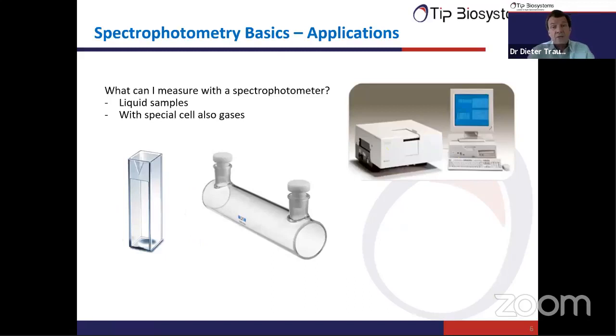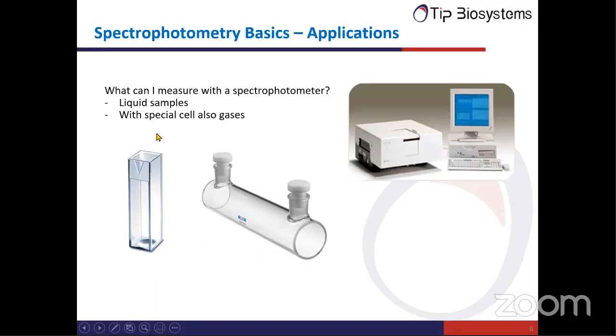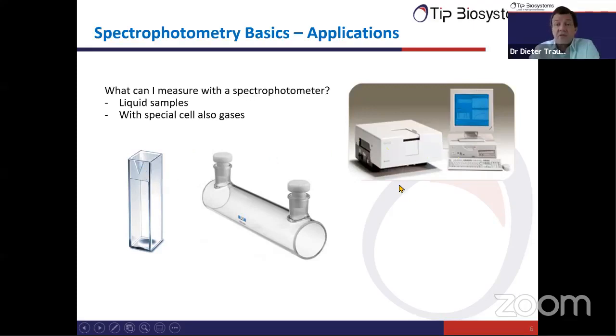So we mentioned already, typically with a spectrophotometer, we measure liquid samples. And here on this slide on the right top, you see a typical spectrophotometer wired to a computer or notebook to control the instrument. To get your sample inside, you have to fill your sample into a cuvette. Those cuvettes are typically made from plastic or from glass. If you measure in the UV region, you need a quartz glass. And then you need to fill your sample into the cuvette, place the cuvette in the spectrophotometer, and take your measurement.